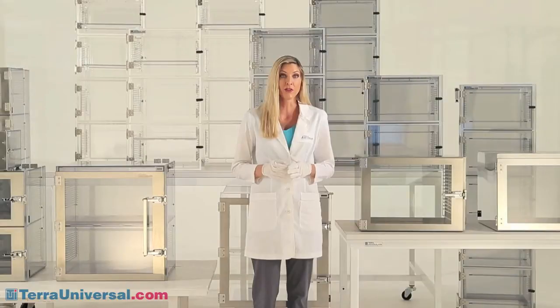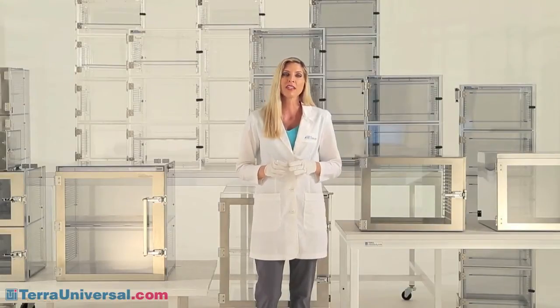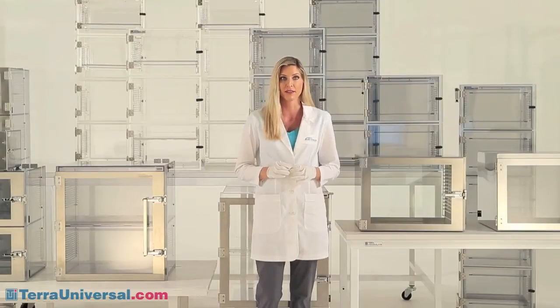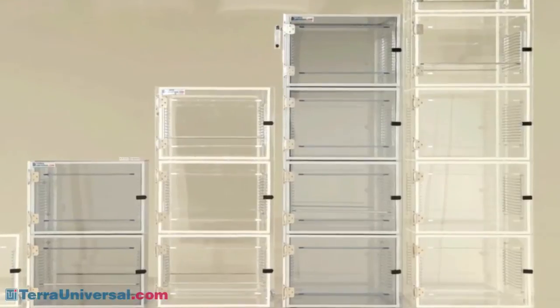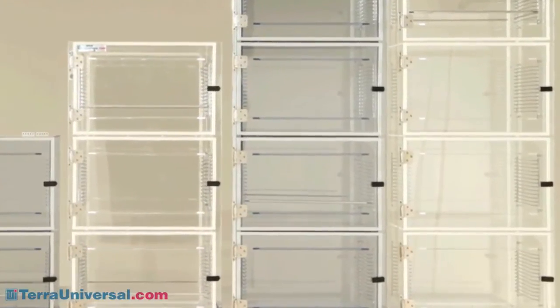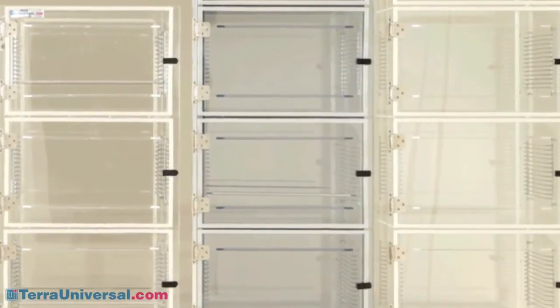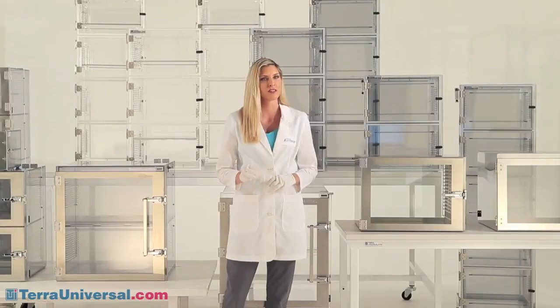Terra's relative humidity controllers operate extremely effectively on both plastic and stainless steel cabinets, but you'll find the stainless steel models better suited for a very low RH set point under 10%. This is because plastic is hygroscopic — it allows moisture to permeate the molecular structure of the cabinet, eventually raising the internal RH level and requiring a higher purge of dry nitrogen to remove it. Plastic cabinets, however, are more economical and meet most RH requirements down to about 10% just fine.